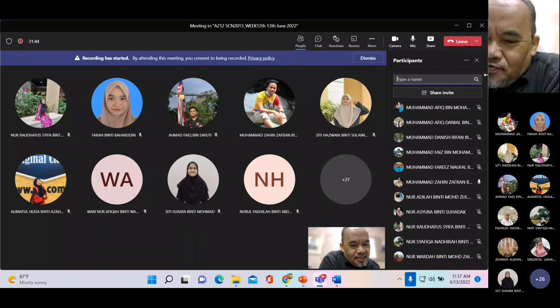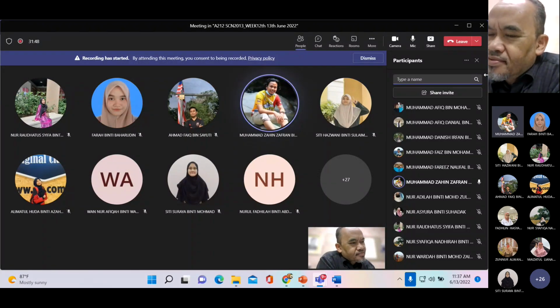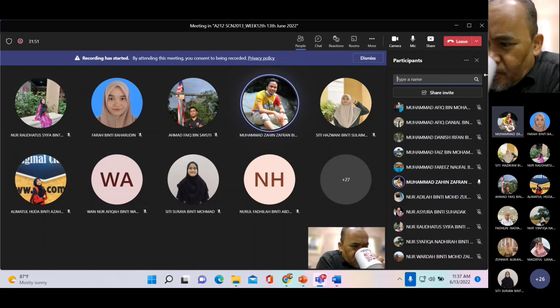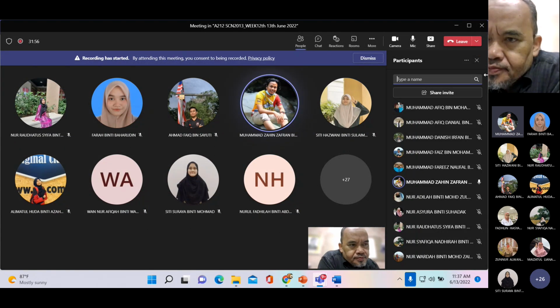Okay, tapi apa yang you faham fluorescent ni, anak dia? Okay, apa yang saya faham, fluorescent ni sebenarnya dia menghasilkan cahaya. Semua bahan yang akan menghasilkan cahaya, masuk fluorescent tu sendiri menghasilkan cahaya kan. So macam mana dia hasilkan cahaya? Dia bercahaya bukan dalam visible macam kita nampak, contoh dia dalam keadaan UV. Contohnya quinine kita tengok tak nampak, tapi kalau kita exposekan dalam UV, kita akan nampak warna dia, warna hijau rasanya. Biru. So biru. Okay.